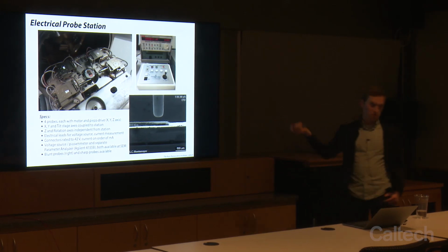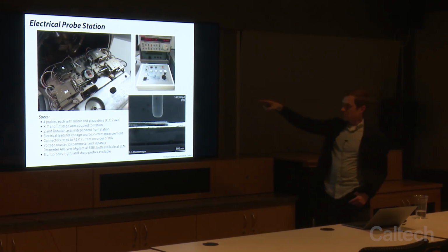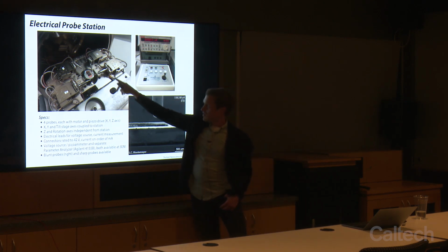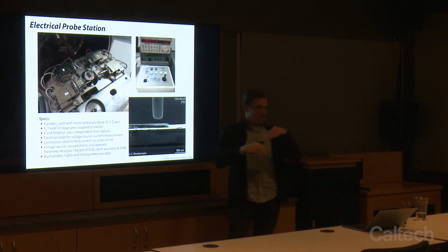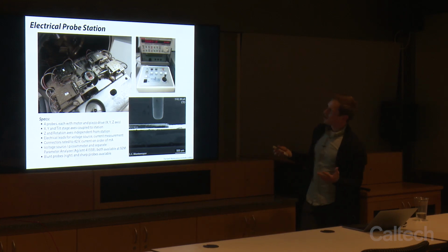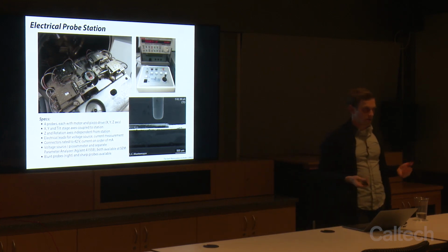We have an electrical probe station in the lab. So it's a 4-point probe station. It fits over the stage. We're able to guide the probes to our different contact pads and do various measurements depending on what kind of function generator you hook up to the system.